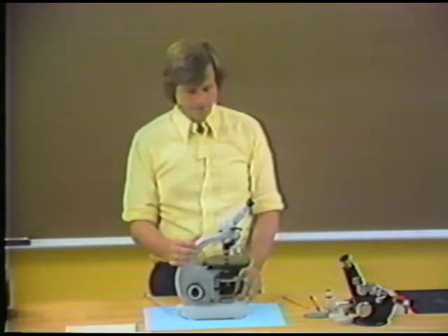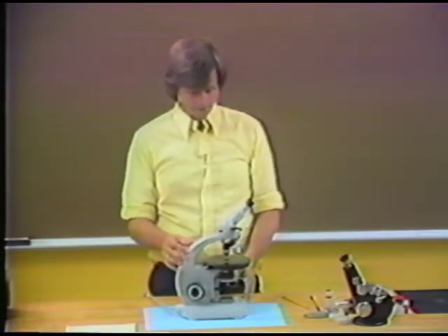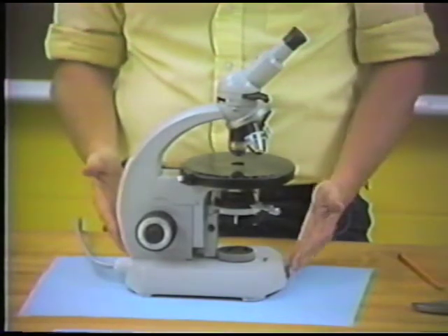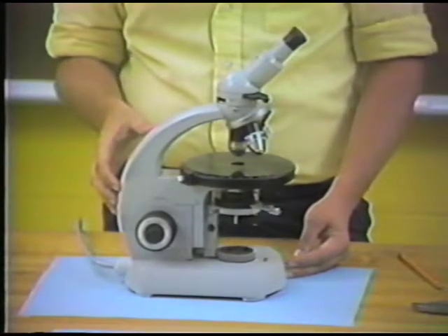The purpose of this tape is to demonstrate to you the petrographic microscope, to introduce you to all the parts and the terminology that are associated with the microscope. And so I'm using a Zeiss student microscope as a demonstration. There's a lot of variation in microscopes, but this one serves as well as any to demonstrate the different parts.